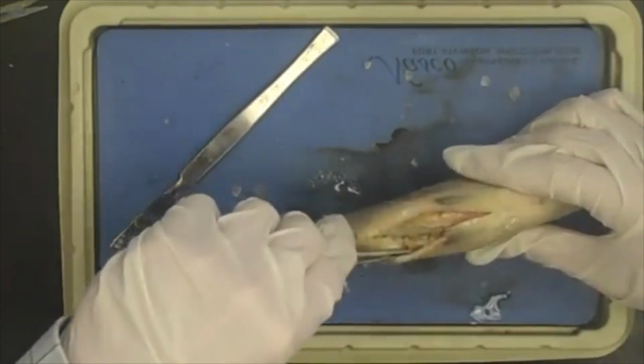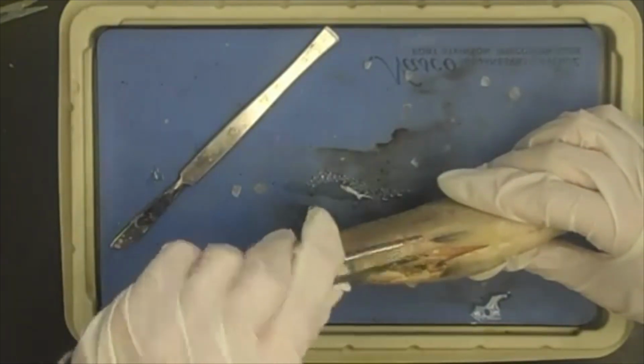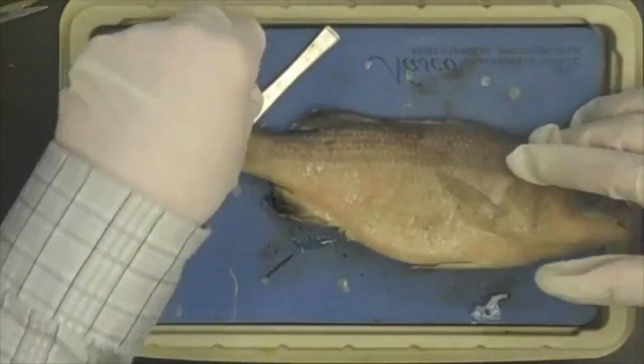As I open up the first incision, I can see immediately that I have an egg-bearing female. The eggs are filling up the inside of the fish. If your fish has a similar material, you want to remove as much of it as possible throughout the dissection.